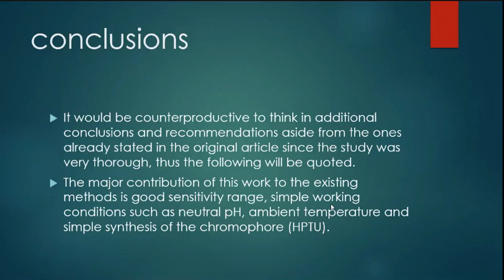That's why they call them like that. Actually, in the paper, they mention how the synthesis of the chromophore is done, because it's a little bit different from a conventional synthesis for the compound, but it's not actually directly related to the problem of determination of copper, so we did not go very deep into that.